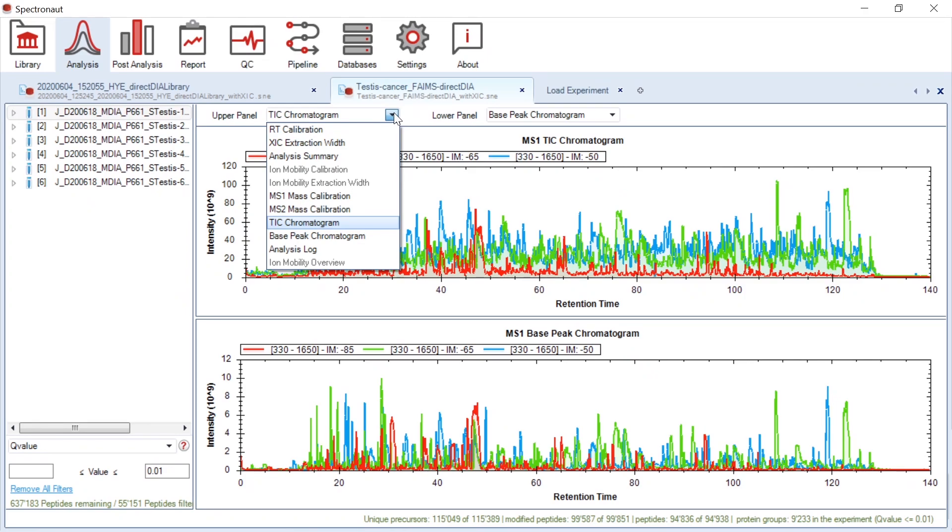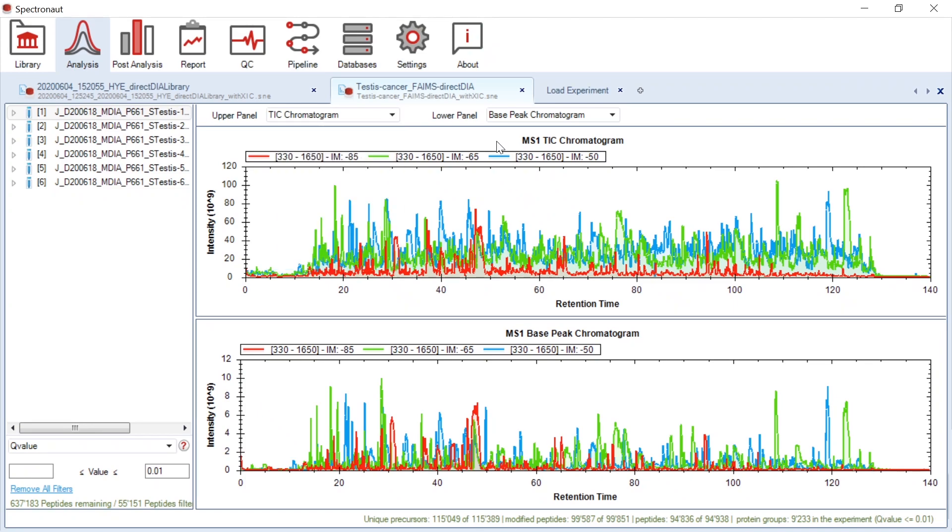When a method with multi-CVs is applied, you can visualize signals acquired for different CVs in the total ion chromatogram graph. The TIC signals acquired for different CVs are presented with different line colors. The same applies to the base peak chromatogram.